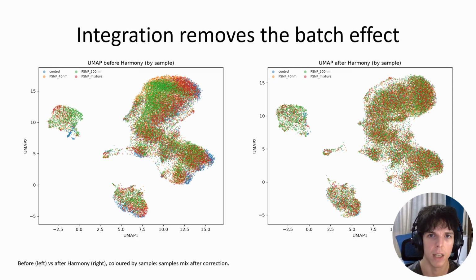One honest caveat is that with a single sample per condition, batch and treatment are tied together. So for the gene level results later, I use the uncorrected data where this can't bias anything.